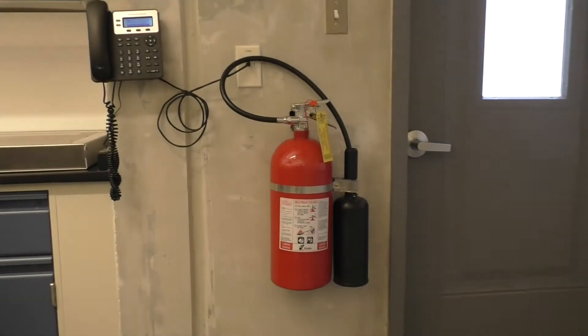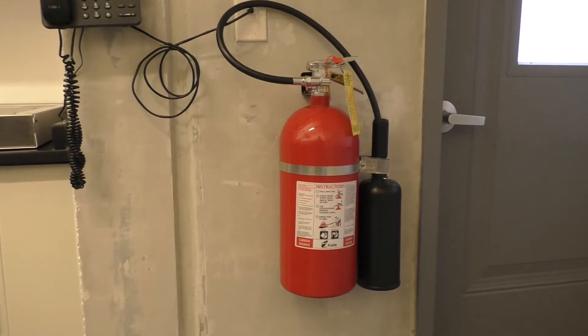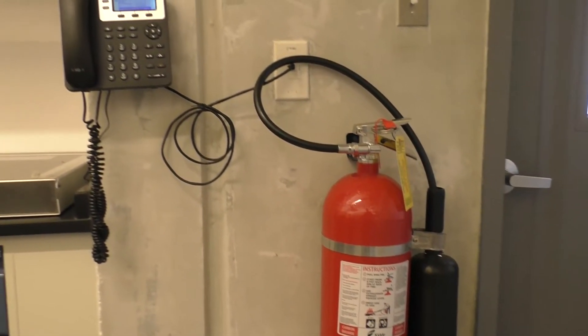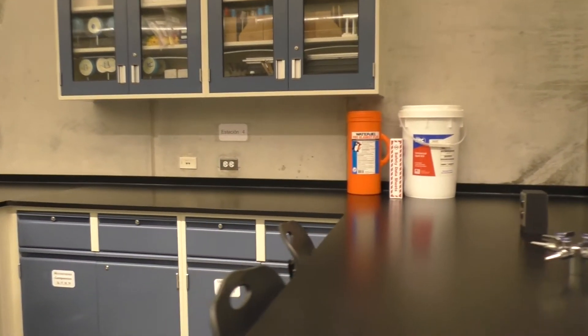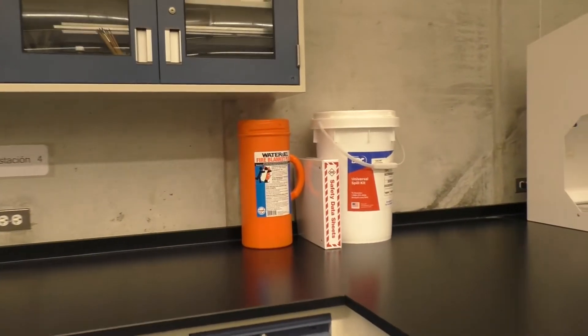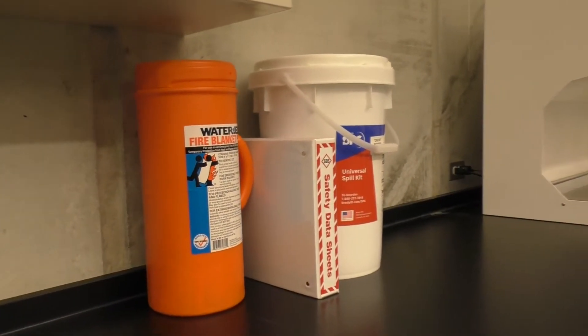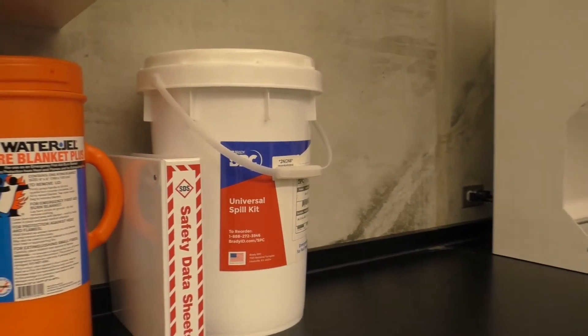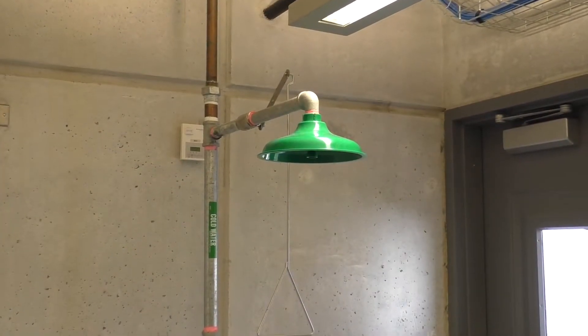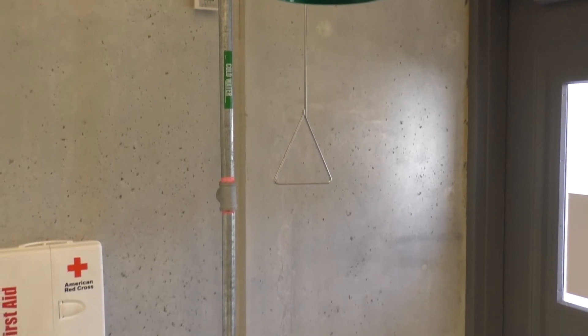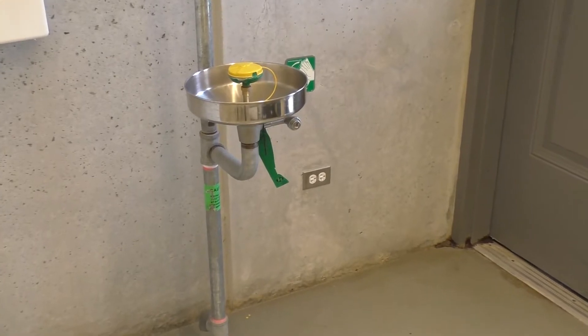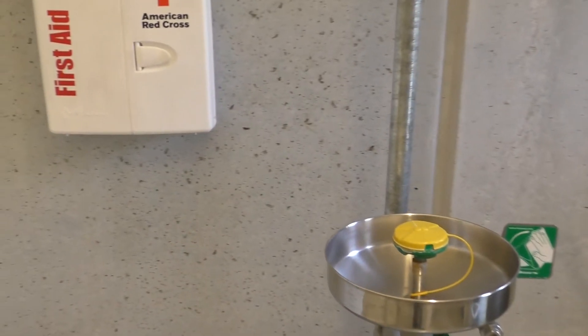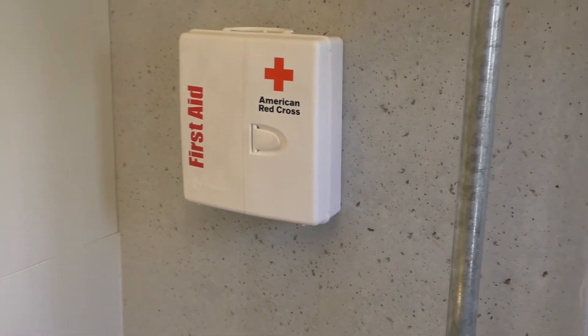The emergency safety equipment of the lab consists of the fire extinguisher near the door, a fire blanket, a chemical spill kit, and an SDS binder with the information of the chemicals used in the lab. Finally, we have a safety shower with an eyewash station and a first aid kit.